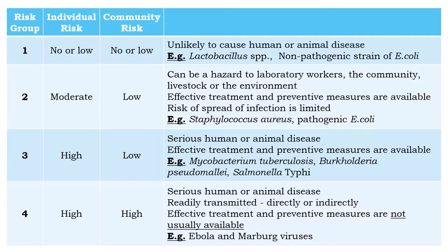Risk group 2 organisms have a moderate risk to the individual and a low risk of transmission to the community. They can infect laboratory workers, the community, livestock or the environment. However, effective treatment and preventive measures are readily available. Therefore, the risk of spread of infection is limited. Examples are Staphylococcus aureus and pathogenic E. coli.